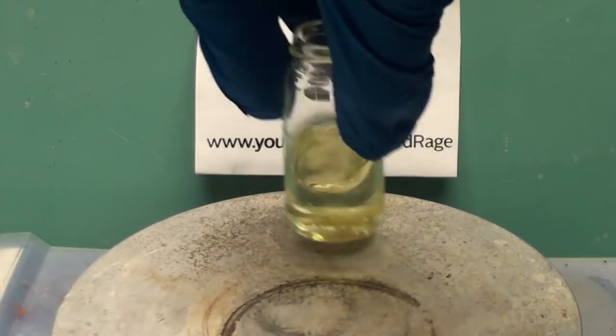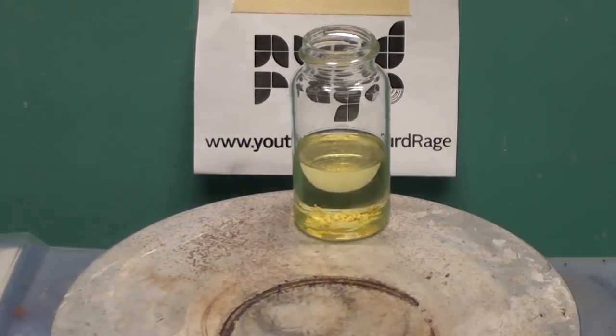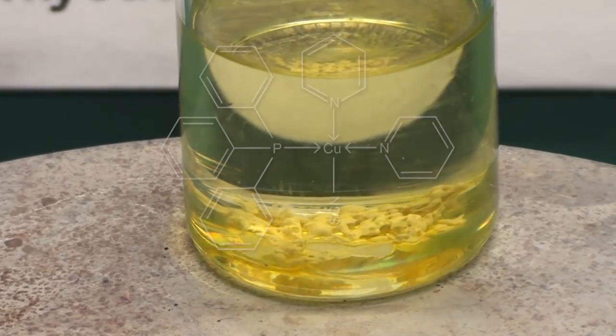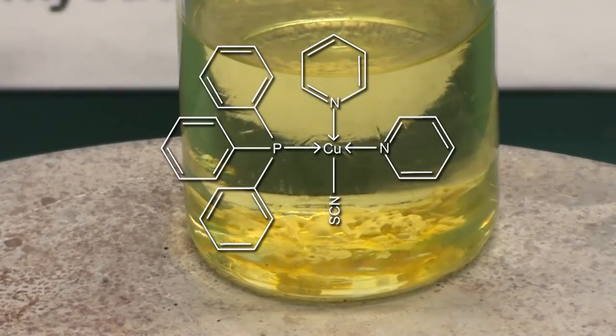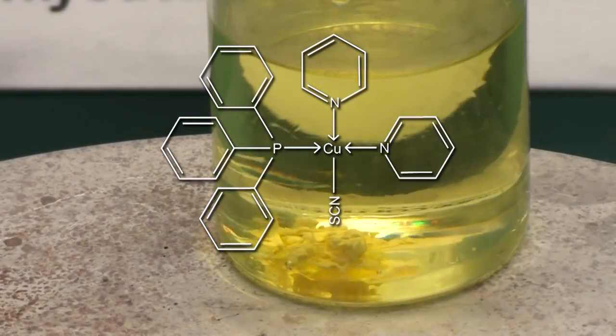Shake it up and then gently heat it with occasional shaking until everything is dissolved. What we're making is a coordination complex with copper in the center surrounded by two pyridines, a triphenylphosphine and a thiocyanate ligand.